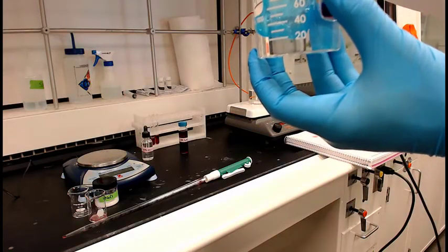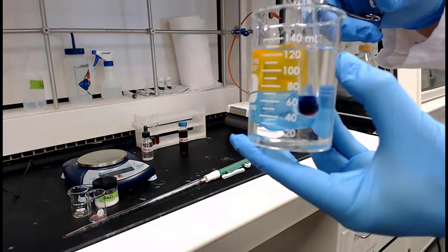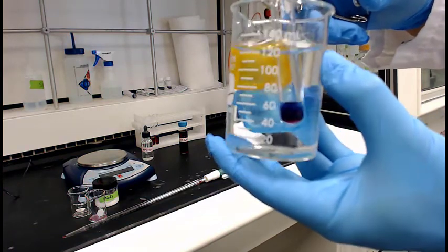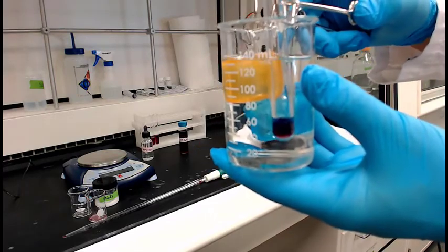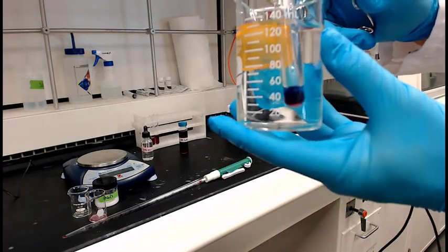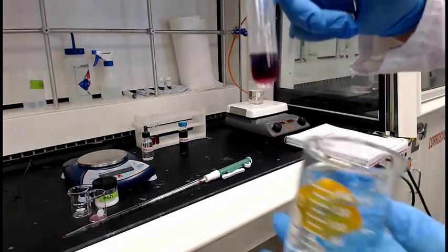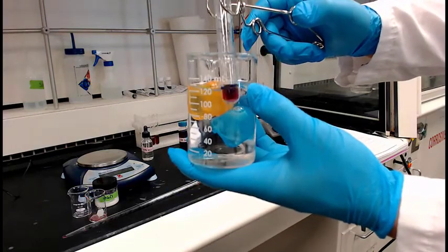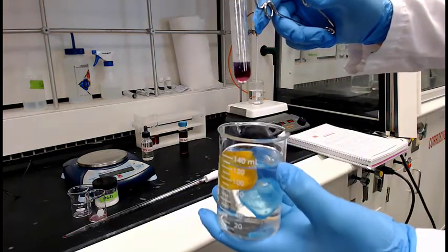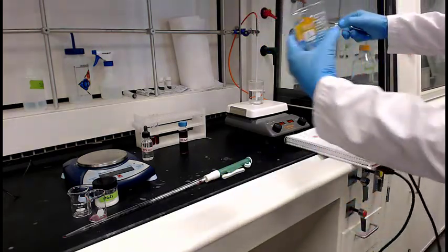Now, work on his hand placement. There he goes. All right. So this is kind of interesting if you can watch this. Went really strong blue, and now it got cold, and see how where it's chilling off, it pushes it back to that purple. So this is where you can see how he's pushing equilibrium.